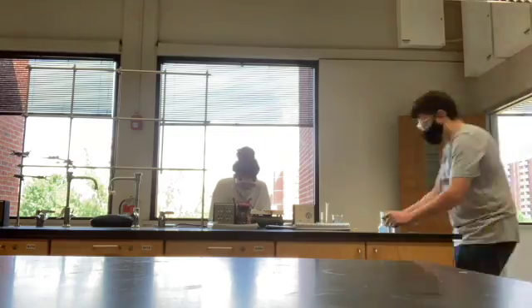A clean lab table is the best lab table. Make sure to clean up and make an awesome environment for whoever is to come next and use the same tools.